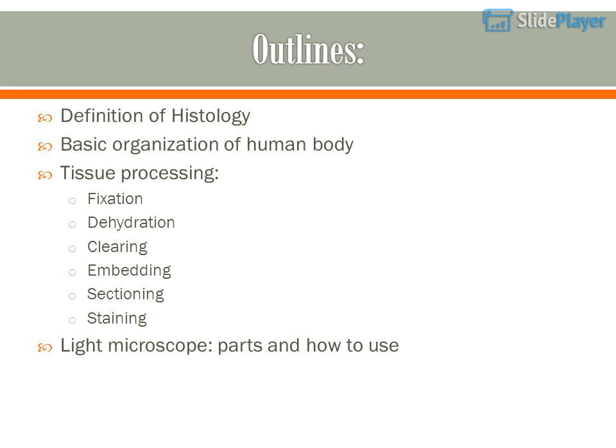Tissue Processing: Fixation, Dehydration, Clearing, Embedding, Sectioning, Staining. Light microscope, parts and how to use.